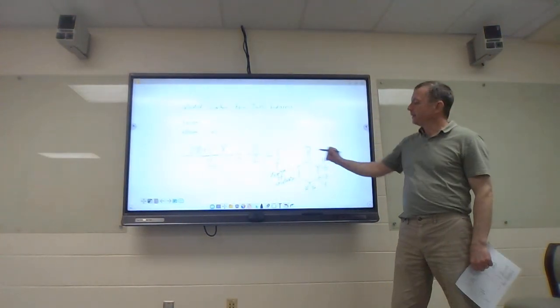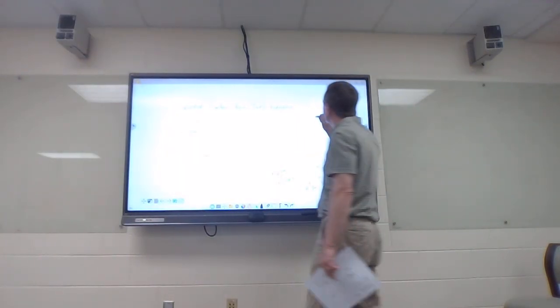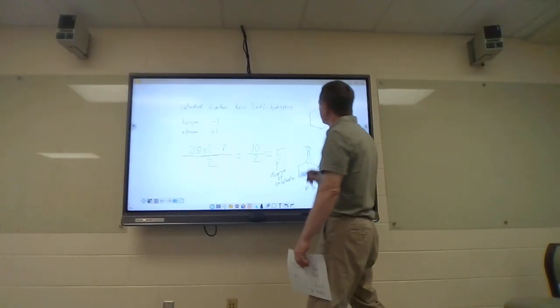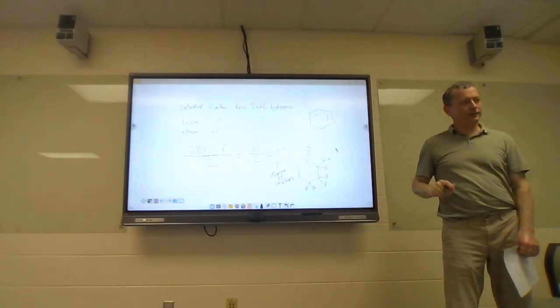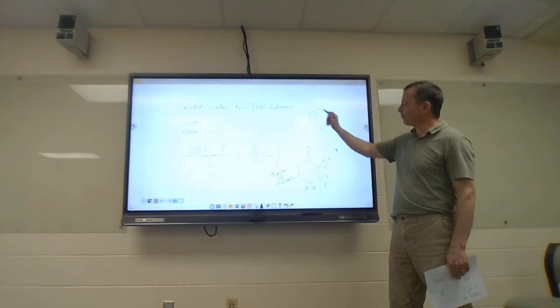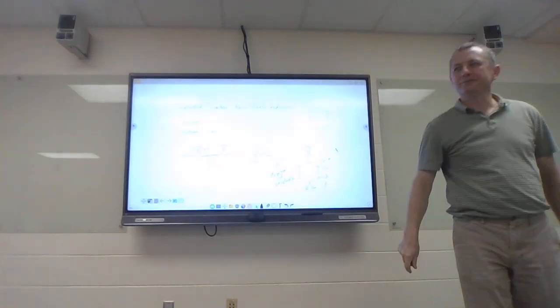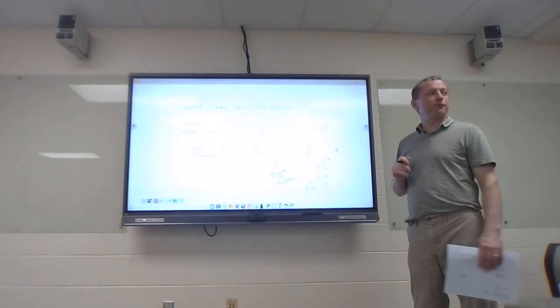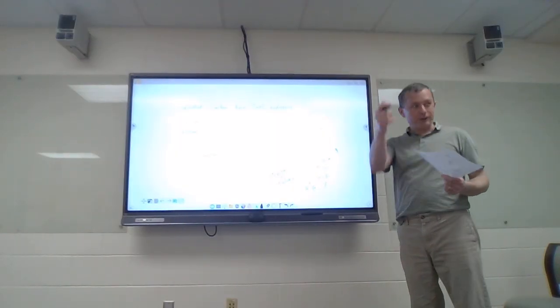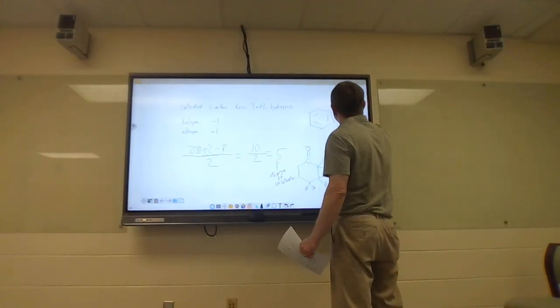Anytime my degrees of unsaturation go above 4, I'm going to look for a benzene ring, because there's 1 degree for the ring and 3 for the double bonds in the ring, for a total of 4. What's my 5th one for this molecule? We already talked about a carbon-oxygen double bond. I'm just going to arbitrarily stick it out there for right now.